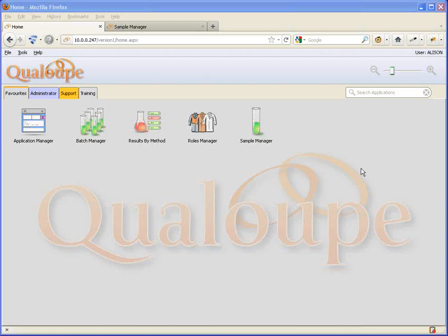This week we're going to look at creating launchers and your own applications. So I'll show you what I mean by that straight away.